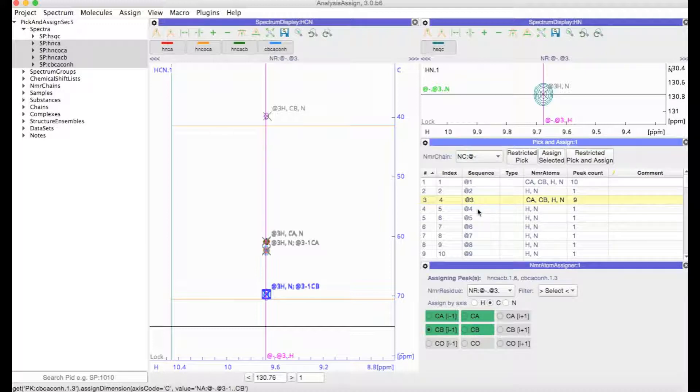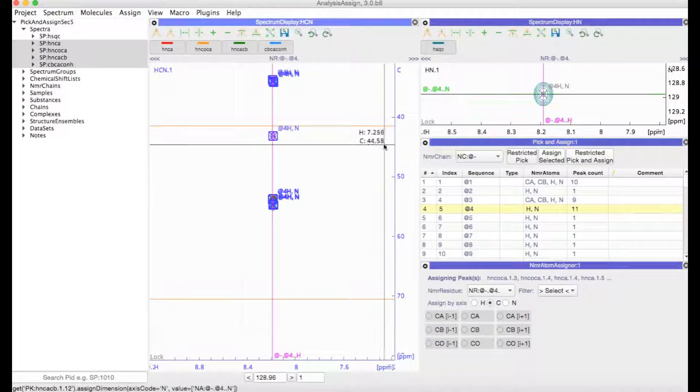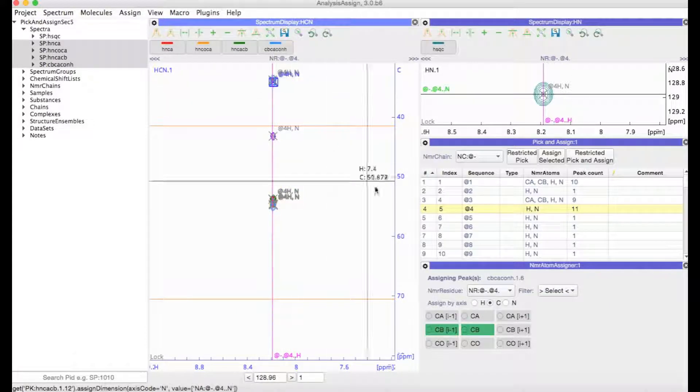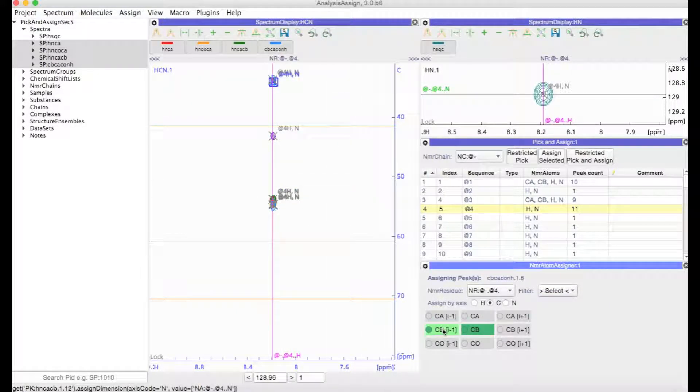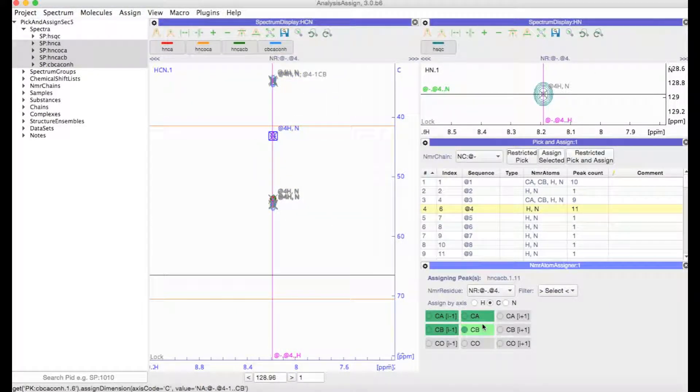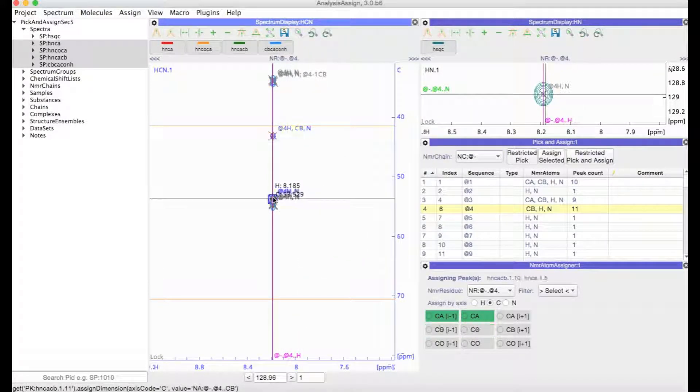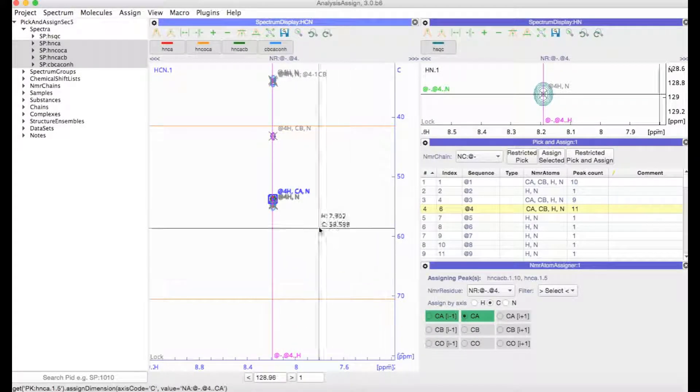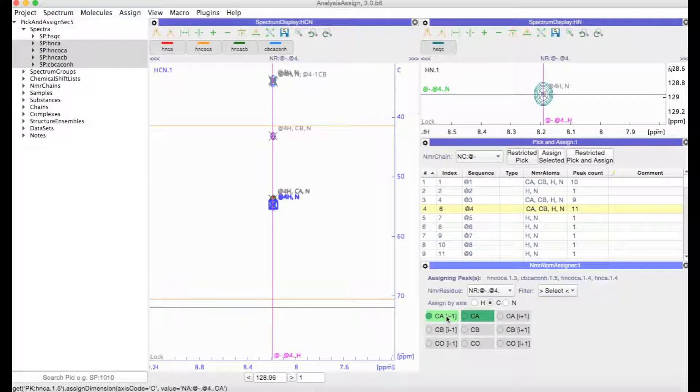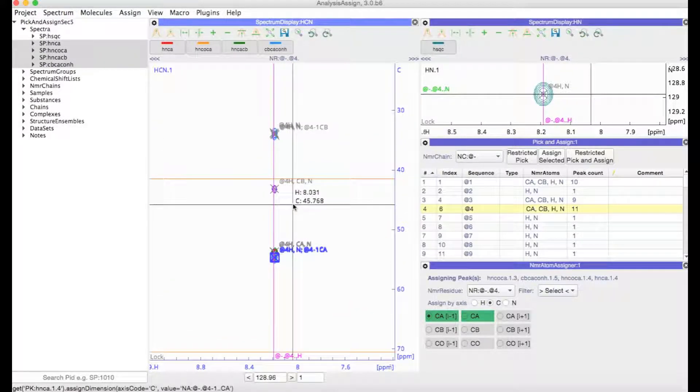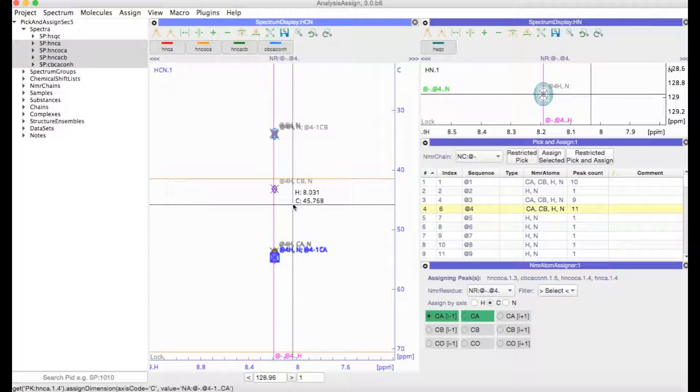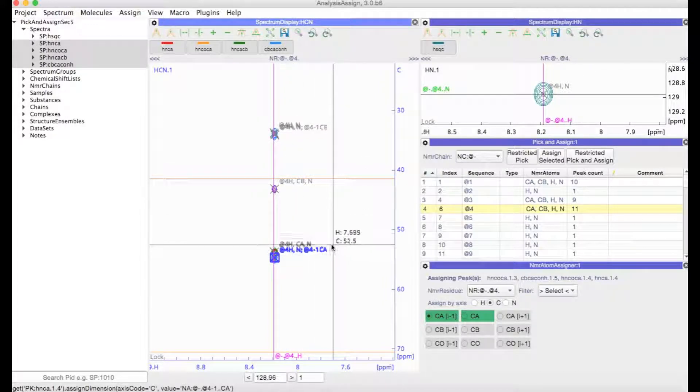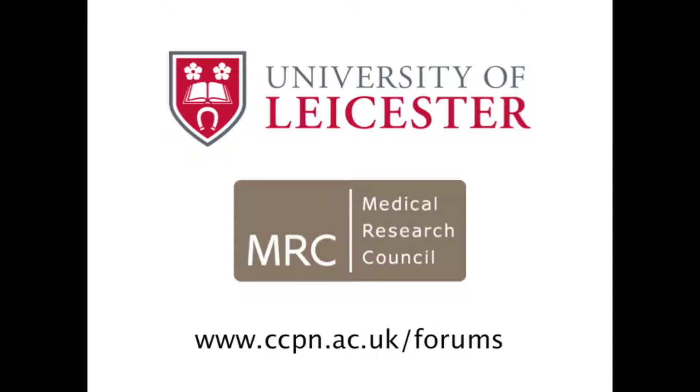And then you can just proceed through the whole of your protein, restricted picking and assigning, and then making your carbon atom assignments. And if you continue with that, then you will end up with a really nice set of peak lists for your 3D spectra, which are clean and have all the NMR atom assignments that you need.